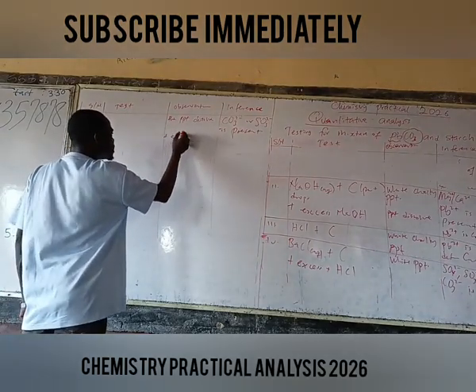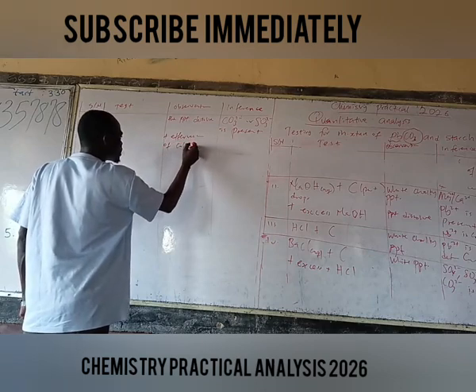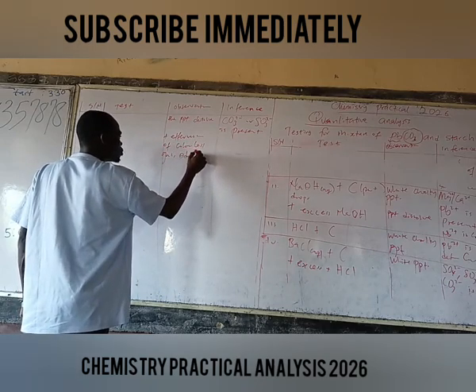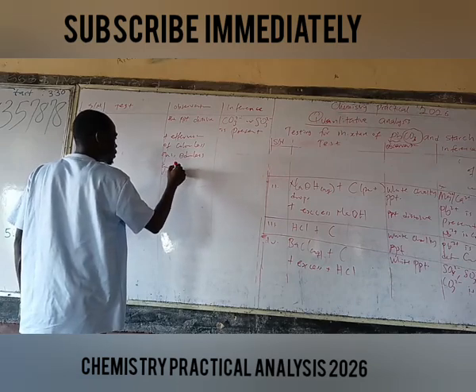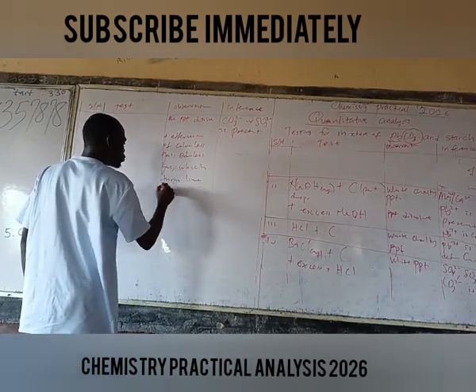Effervescence of colorless, odorless gas, which turns lime water milky.